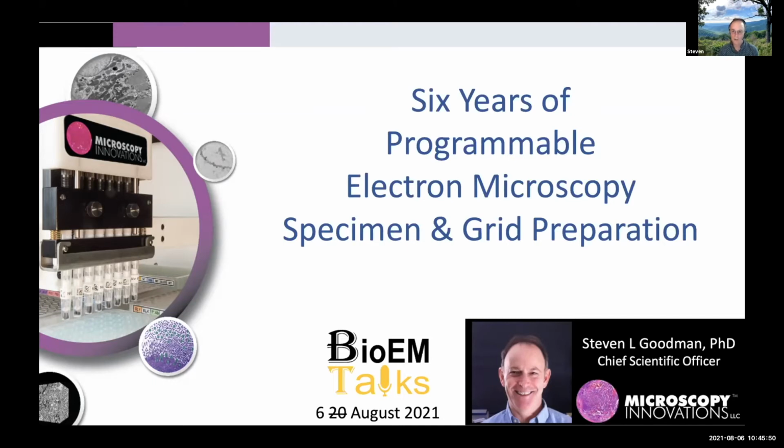This morning, at least in my time zone, I'll present a bit of EM history from the past to the present and summarize the 6-year history and where I think I see some of the future of fully programmable EM preparation of specimens and grids is going. So some history to put this into context.